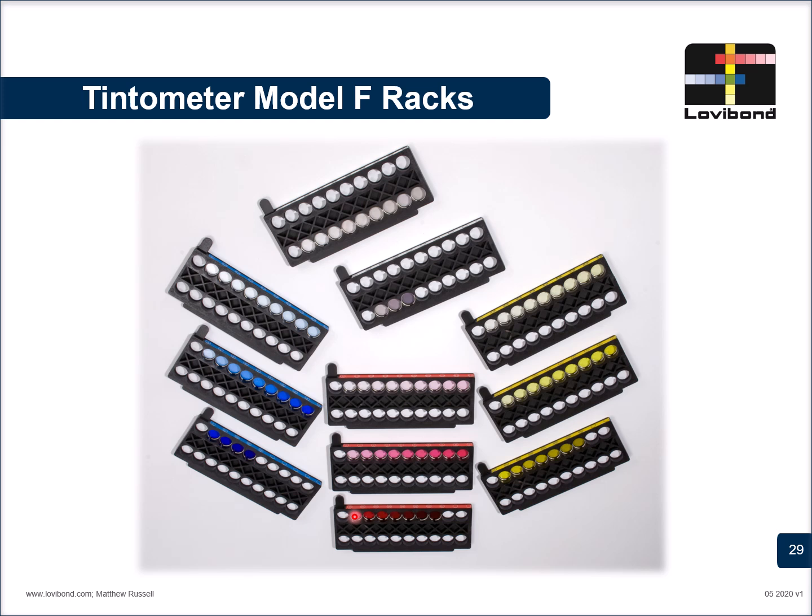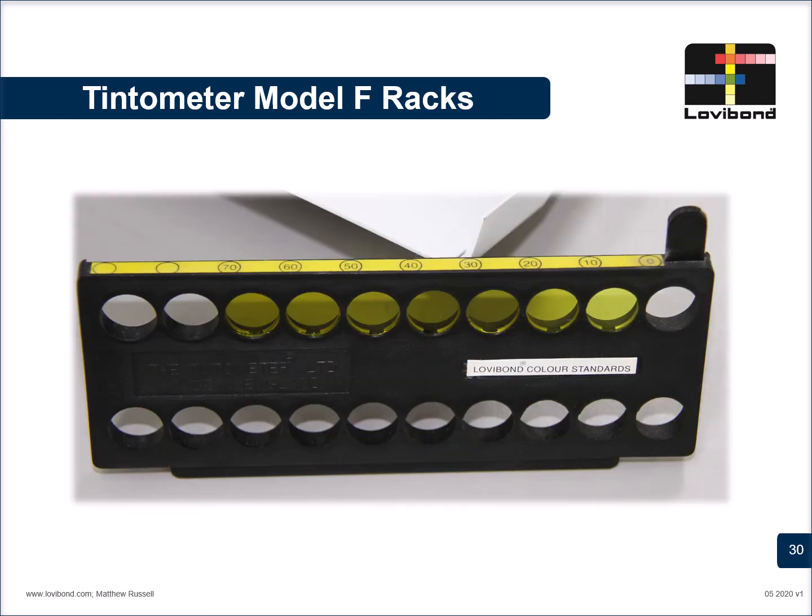Remember, we are working with oils. And as we see when we work in our kitchens, because of the usage of oil, the glasses get very, very sticky. Similarly, these Model F racks also are made of glass pieces. And if they are not cleaned frequently or serviced properly, they may affect your readings. One has to be trained enough to clean them and put them back. If any kind of alignment issue comes in each of them or one of them, the results will completely get disrupted. So, maintenance matters. Keep your instrument in peak condition.